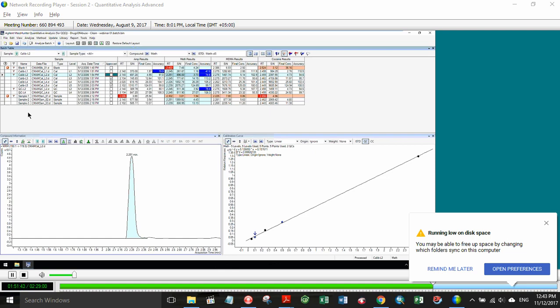One option, and again, we can ask for clarification offline if this doesn't answer it: once we set up a method, we can save that method as a separate independent file. We can save it as an .xml file, which is very nice for portability, or we can save it in the standard method folder setup.